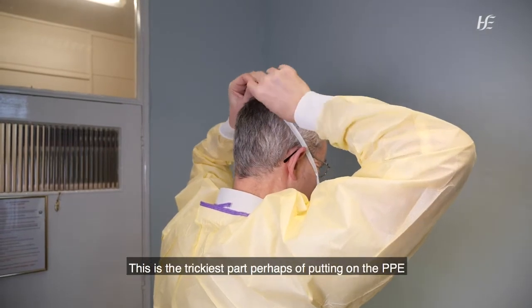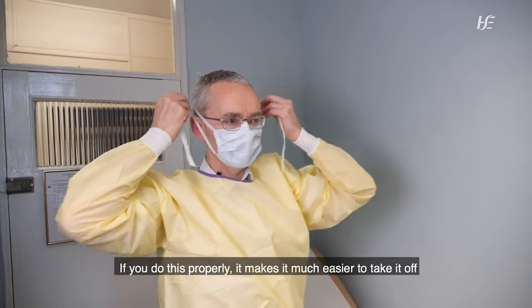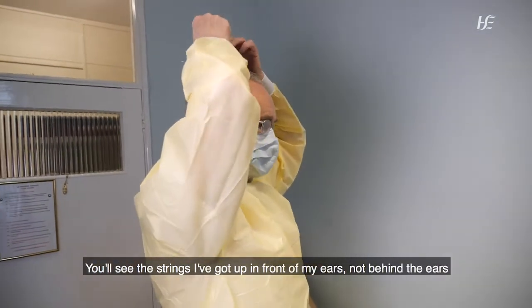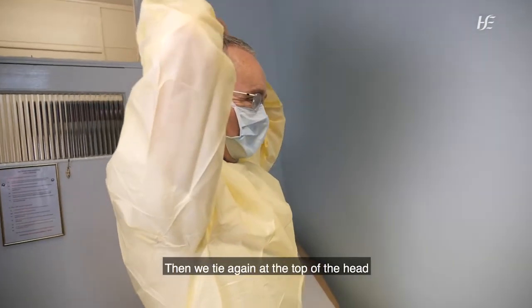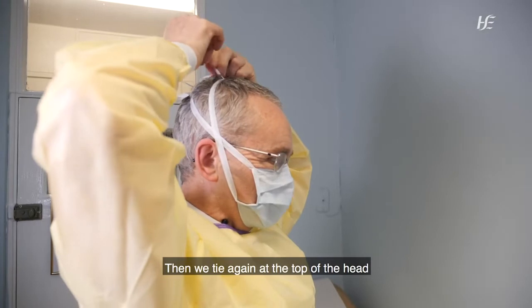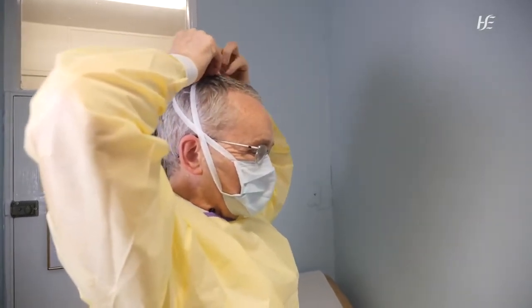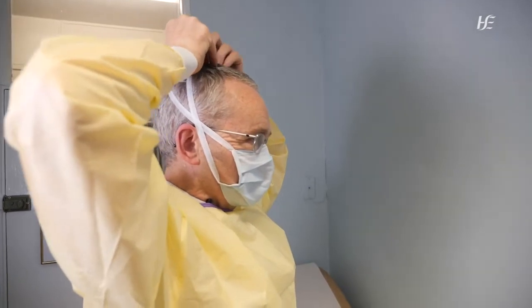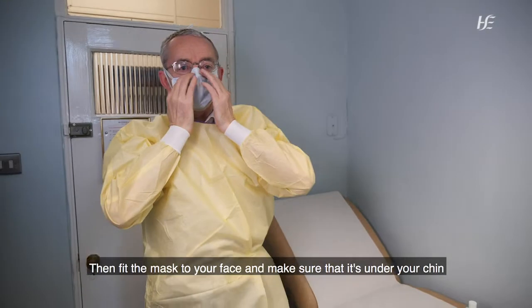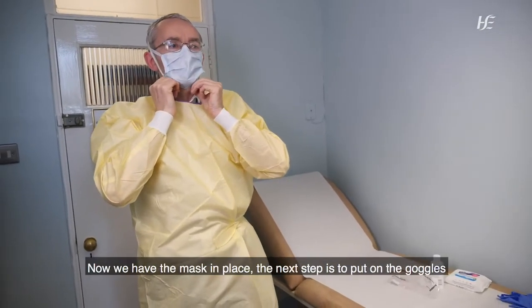And this is the trickiest part perhaps of putting on the PPE, and if you do this properly, it makes it much easier to take it off. You'll see the strings have gone up in front of my ears, not behind the ears. And then we tie again at the top of the head. And then fit the mask to your face and make sure that it's under your chin. Now we have the mask in place.